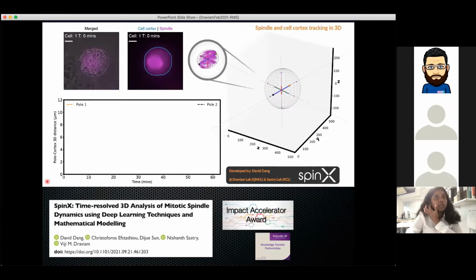Although we started in 2017, I have to say, I just loaded this paper 3 days ago. It took us a very, very long time to build a clean deep learning method with modeling tools for tracking spindle dynamics. It's on bioRxiv if you want to see, but for the purpose of the talk, David made a very nice movie for illustrating this point.